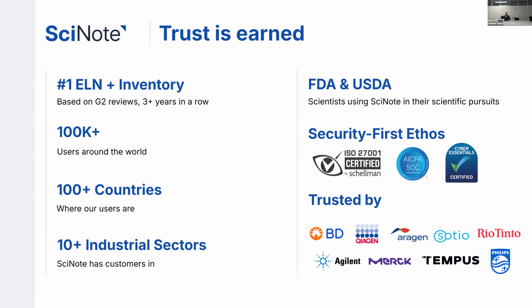Cool. Quick introduction into SciNote, for whoever doesn't know us. First of all, we are the #1 ELN plus inventory system based on G2 reviews, and have been for 3 years in a row. We have more than 100,000 users around the world in 100 plus countries, and in very different sectors as well. Of course, the majority are pharmaceutical, biotech, and academia. But what we are very proud of is that we are also supporting FDA and USDA in their scientific pursuits.